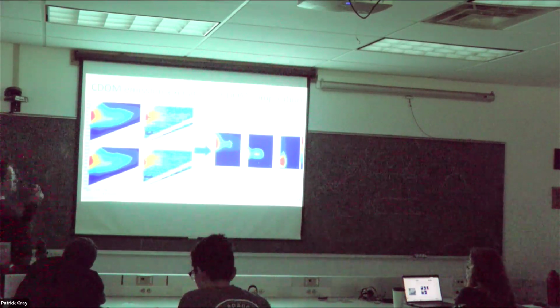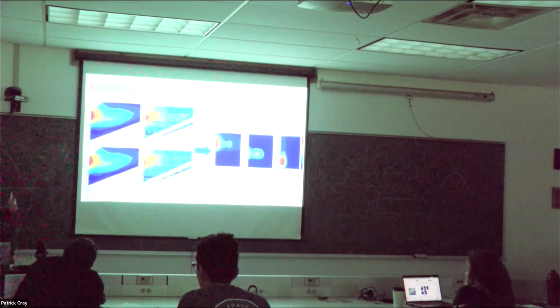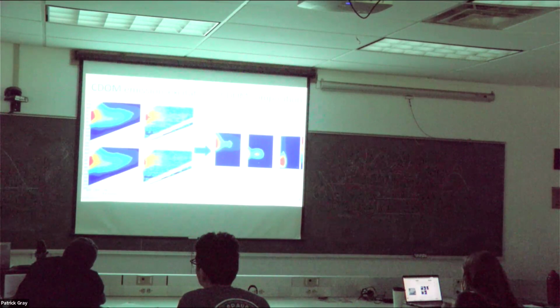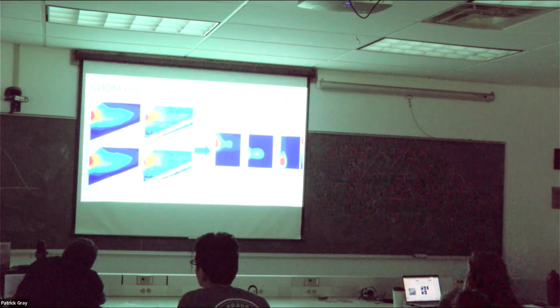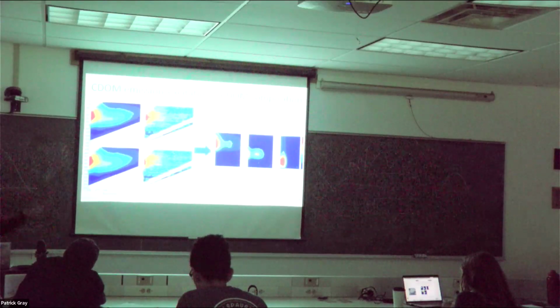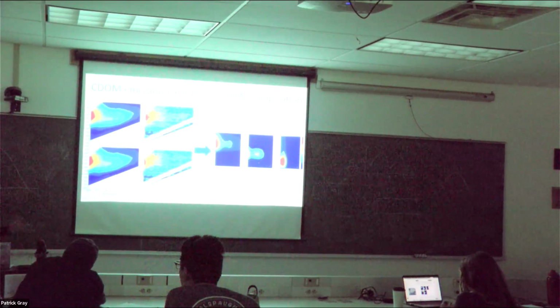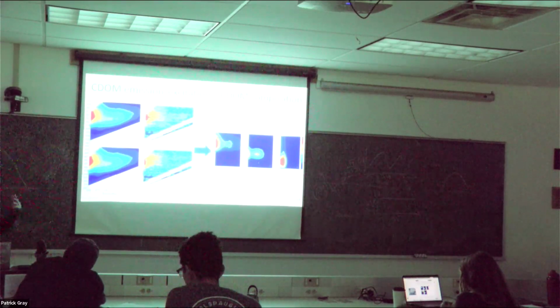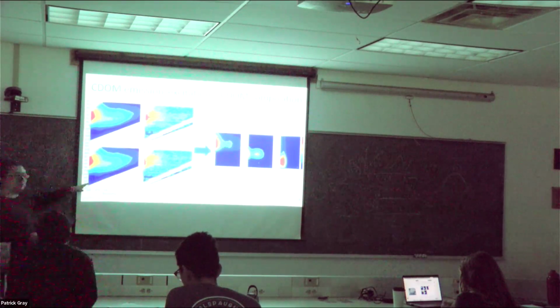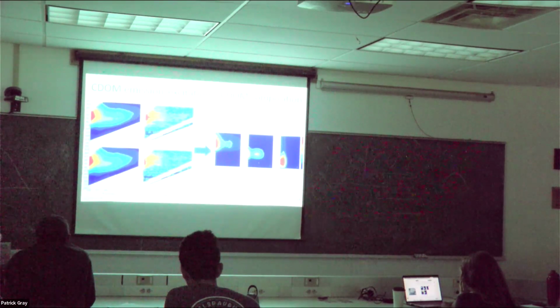Thank you. They dropped the paper and it's really cool. There are not too many people who are measuring the excitation emission spectra and actually trying to use it to differentiate different types of organic compounds in the ocean. It's really useful, but it takes a long time to do. You have to know what you're doing. To do some kind of mass spectrometry on the side to actually pair these would be insane, taking a sample of water and doing mass spectrometry to determine all these different types of organic molecules. It's really hard and takes a long time. So this is kind of a cheat, a proxy that you can use to say something about the diversity of the organic material in your sample.